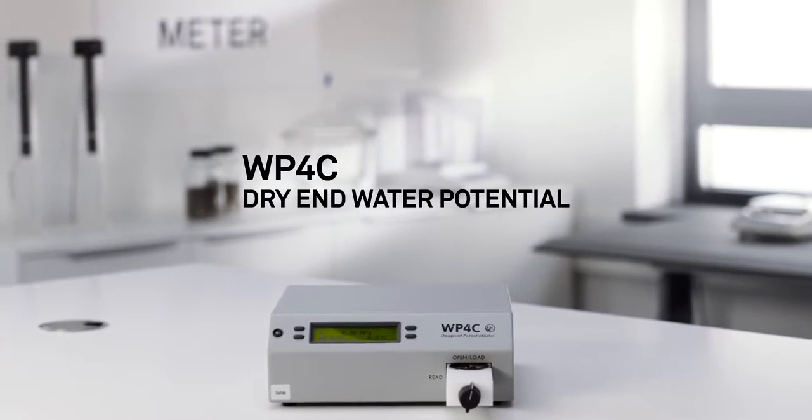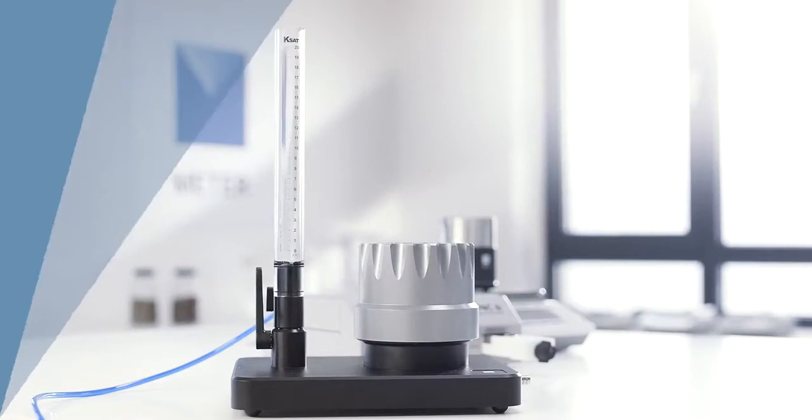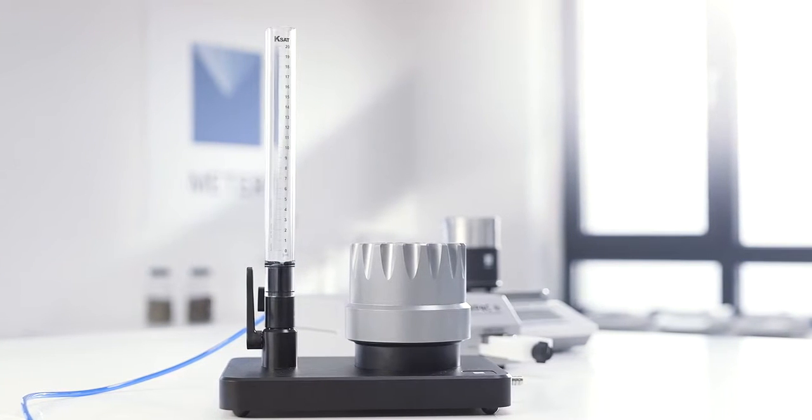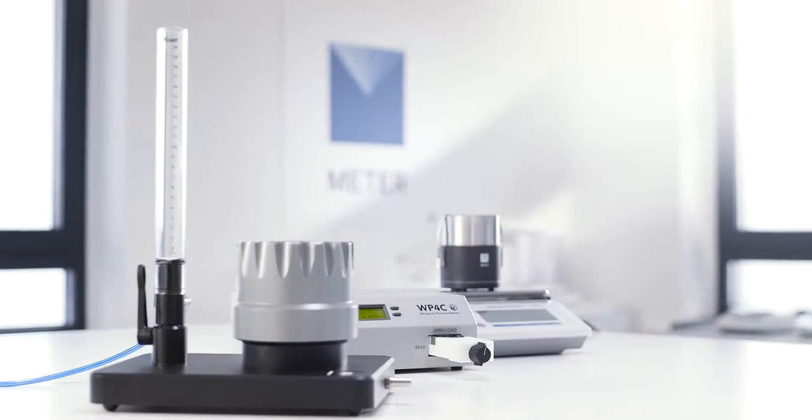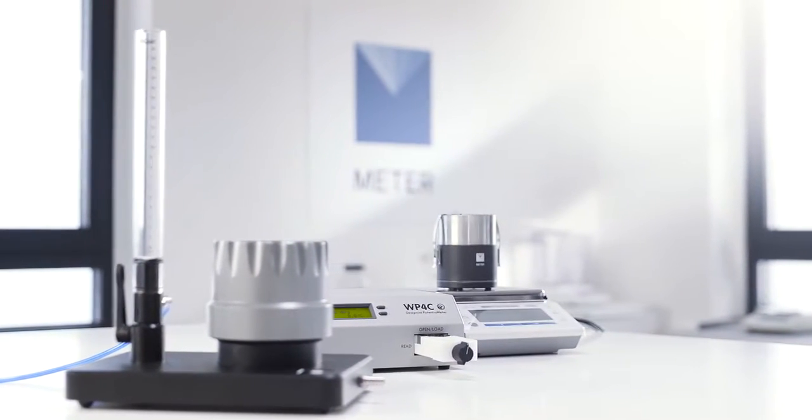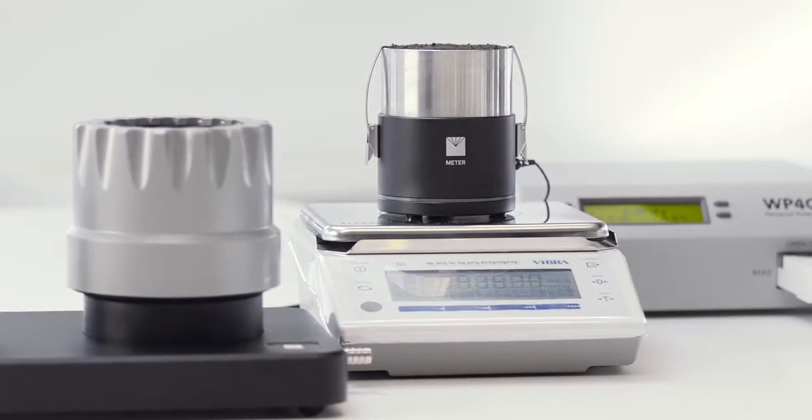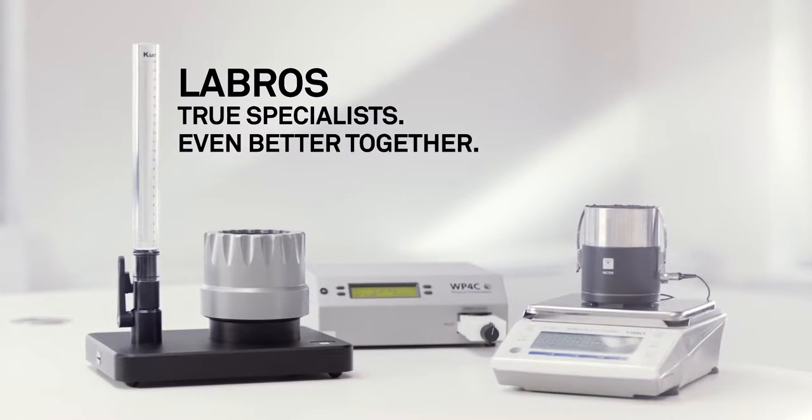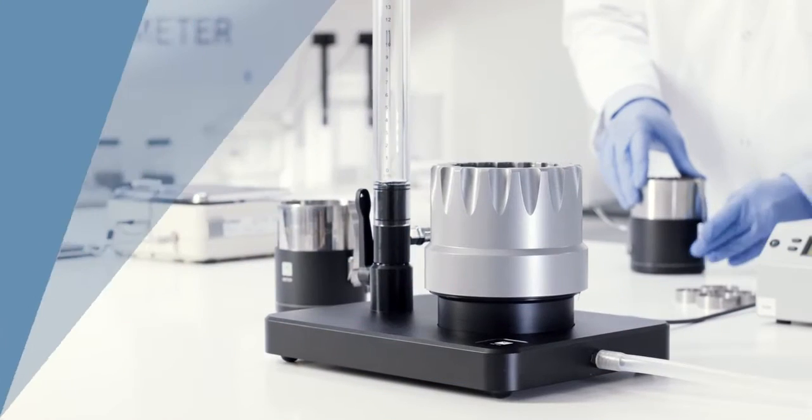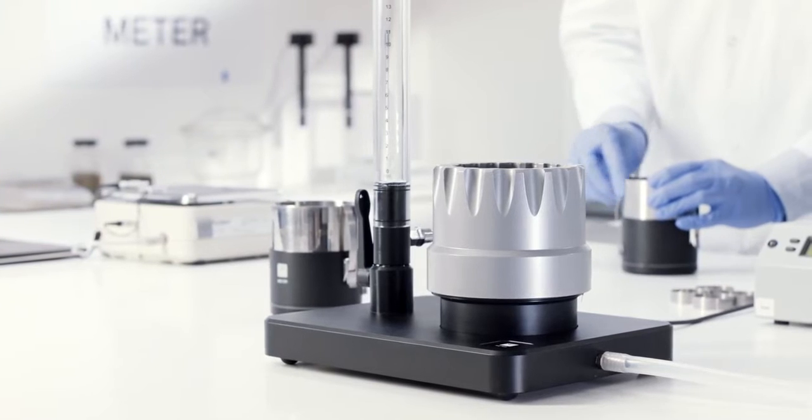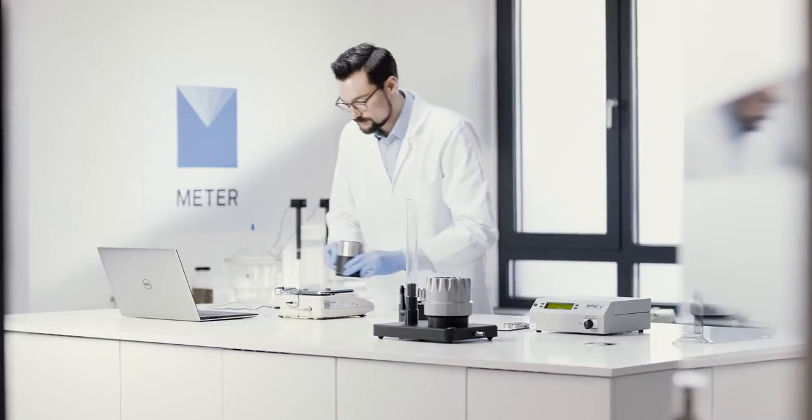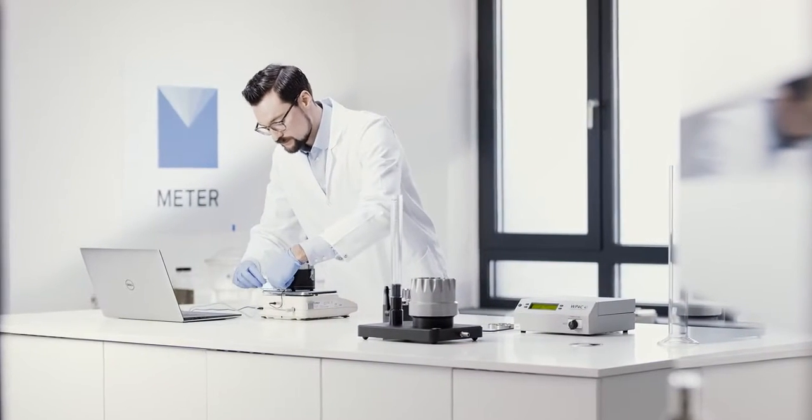There's one thing better than a specialist though: a team of specialists working together. Labros by Meter—true specialists, even better together. The instruments are designed to work not only individually but also collectively, accelerating processes, heightening precision, reducing errors, and ultimately saving you time and energy.